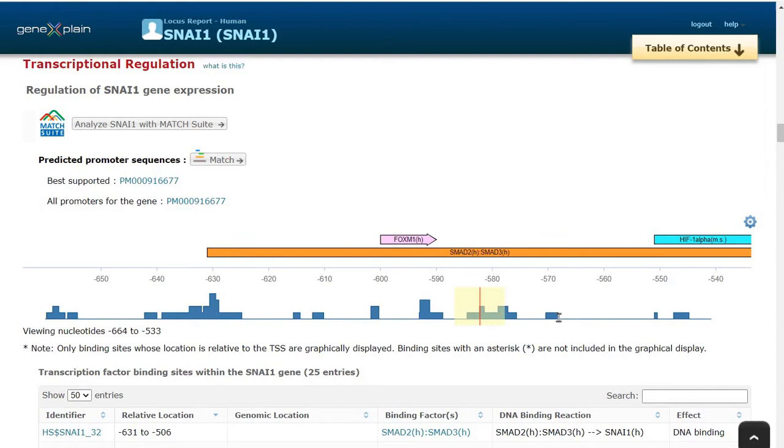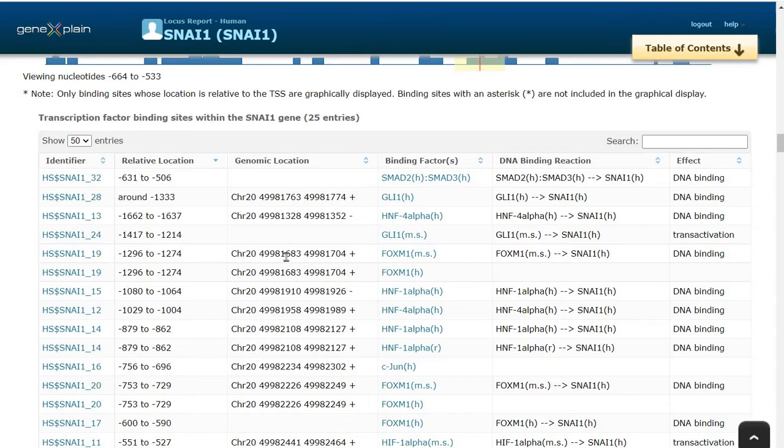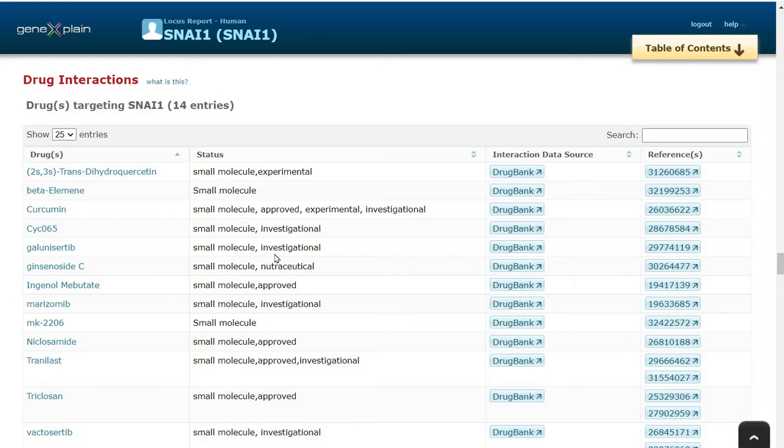The same information is available in the tabulated form, including the position within the chromosome. We can click and learn more about each transcription factor by the clickable link.